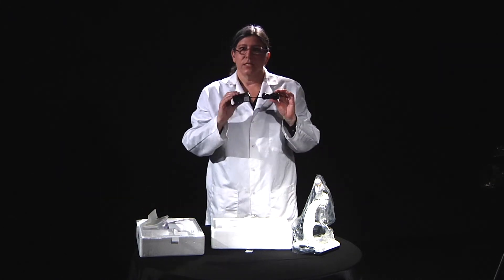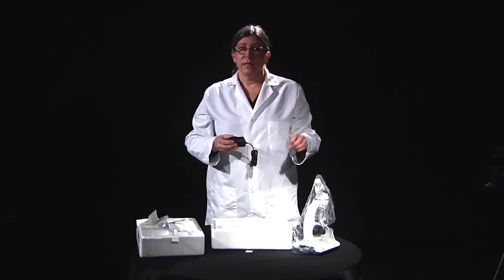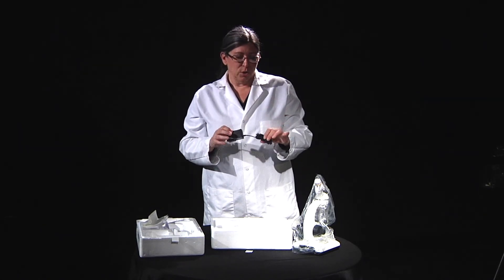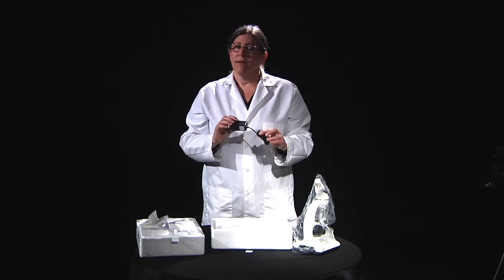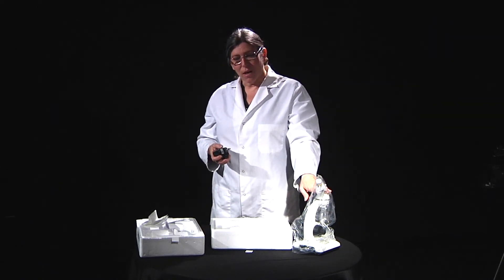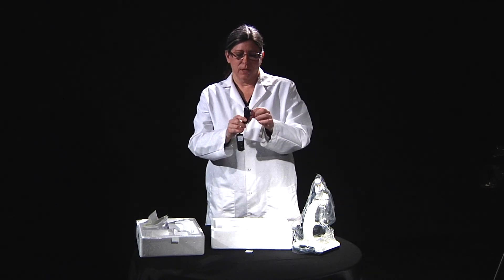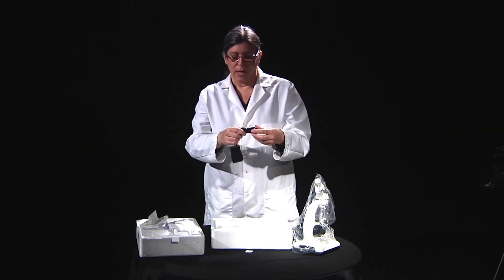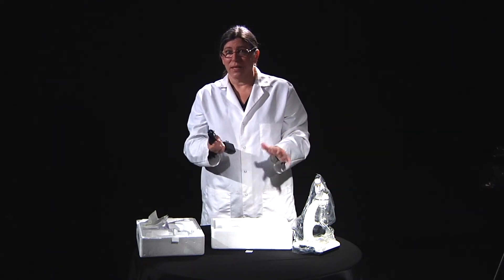And finally, this is the charger. Your microscope is a battery-powered microscope, but the lithium-ion battery does need to be charged. So when you get this, the first thing that you should do after taking off the plastic is to plug it in for about eight hours. You want to have it fully charged so that we're not destroying the battery. The charger also comes with a little twist-tie to hold the wires in place — keep that because otherwise the microscope won't go back into the box nicely.